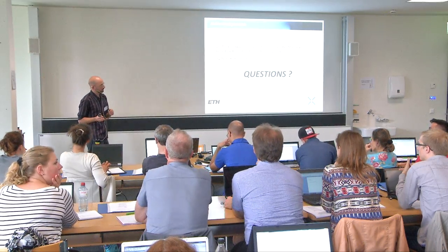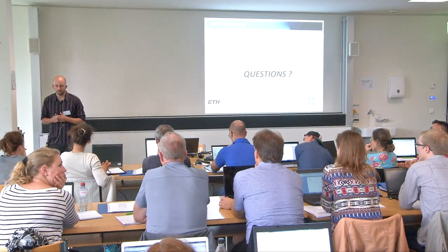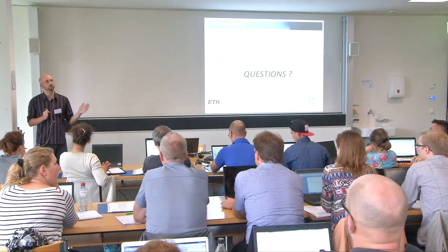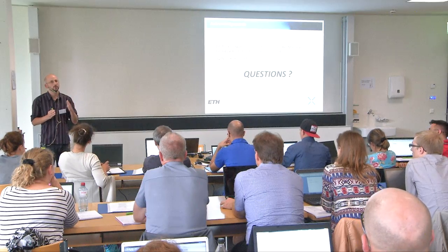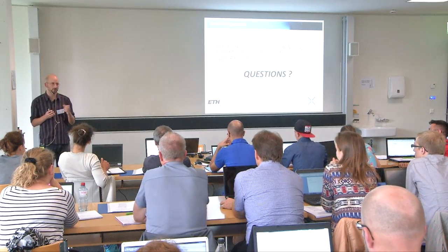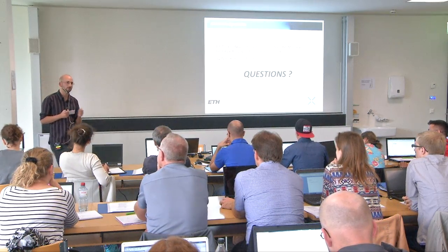So the recommendation to work with Y-ions came, as you mentioned, from the fact that when we want to transfer libraries between machines, quite often the Y-ions are more conserved and we can use them more easily. B-ions, depending on the type of fragmentation, sometimes degrade very fast, and then we are only left with small B-ions and we don't see the whole series.